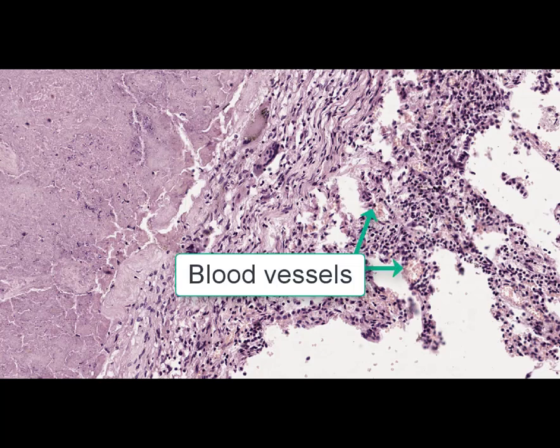In addition, there are a small number of blood vessels in the zone of specific inflammation, which is one of the key differences between the microscopical structure of tuberculoma in tuberculosis and gumma in syphilis.